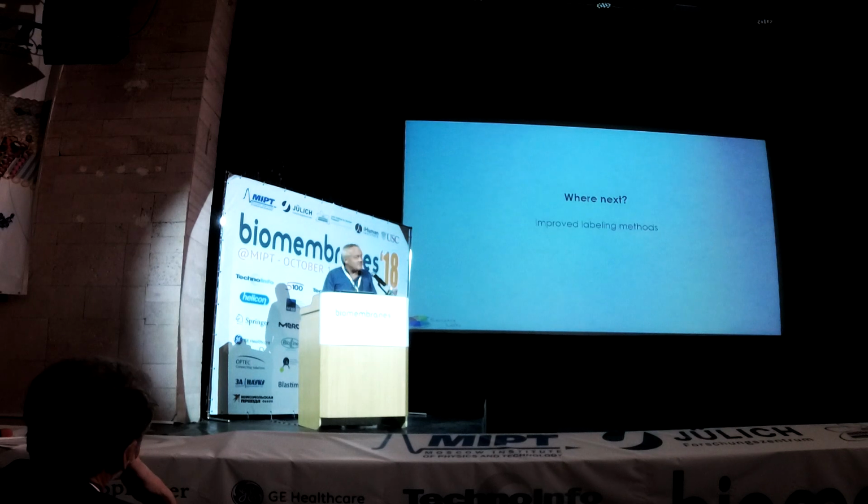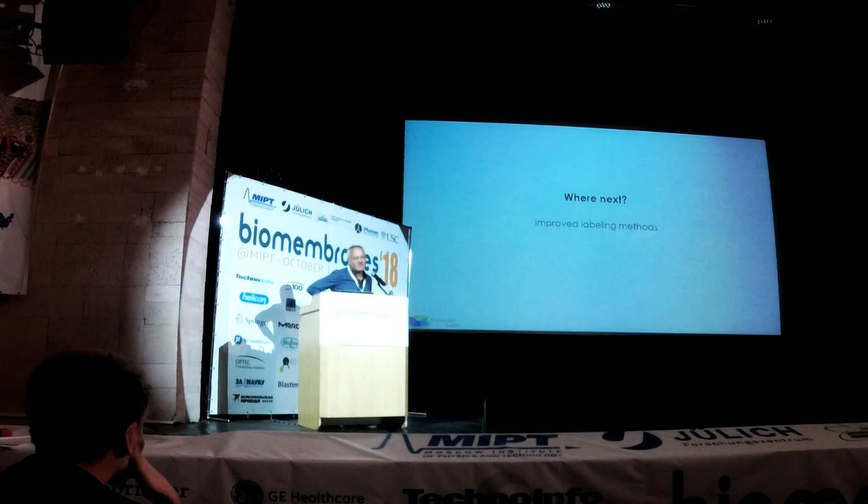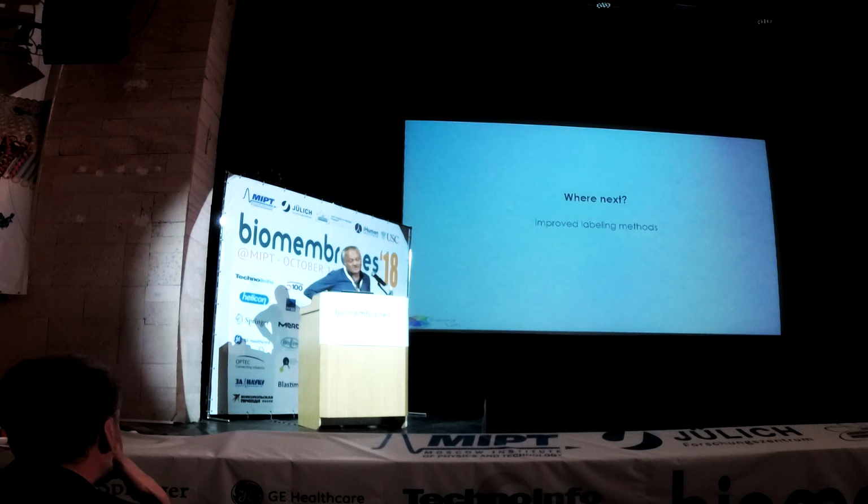Okay, the last two to three minutes, I'm now at 30 minutes. I will share with you some results of what we did concerning changing the methods of how we label our proteins of interest that we want to visualize by super-resolution microscopy. Of course, in these primary materials, what else can we do than using antibodies? There are not many alternatives.